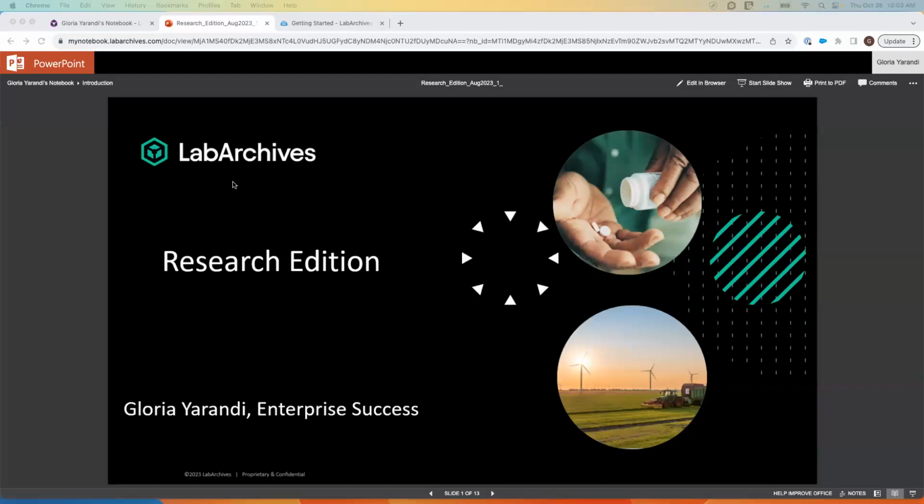Cool. So as Ashley mentioned, today's session will focus on the research edition of LabArchives. Let me share my screen. Okay, so first we'll start with a slide deck introducing LabArchives, and then afterwards we'll transition to the live demo.